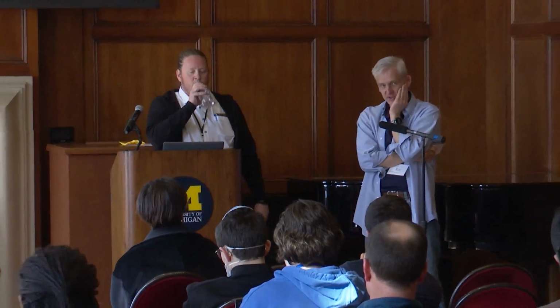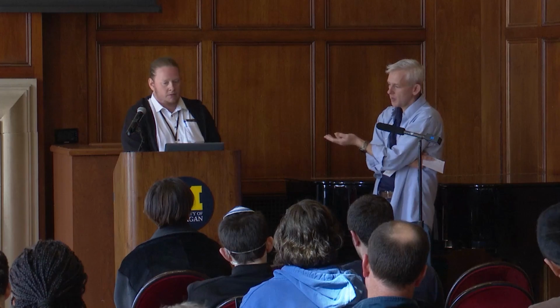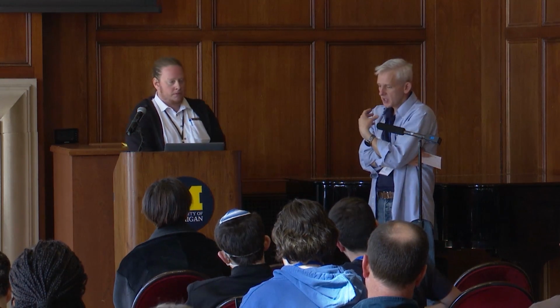Well, that's very exciting, Max. I think it's very nice that we've had a lot of X-ray micro CT today, and we had a TEM talk this morning about cellular biology on the neuronal growth cones, and now we have an SEM talk about the RPE cell biology. As scientific imaging biologists, we can appreciate that we can go asking questions and find answers to questions that we weren't asking, and discover things along the way. I mean, all disciplines can, but for imaging biologists, it's literally right in front of our eyes.